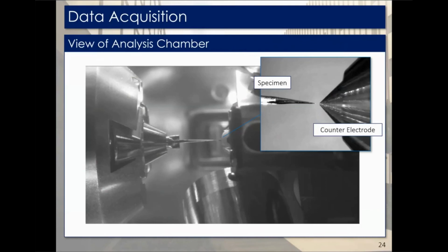And what we need to do is line that up with the counter electrode. So the counter electrode, this local electrode, is basically a hollow metallic cone, a little foil cone with a very small aperture opening. And we'll basically line up our sample right to that aperture. So we'll create the field there, and that'll create basically the area where we'll have the field evaporation occurring.